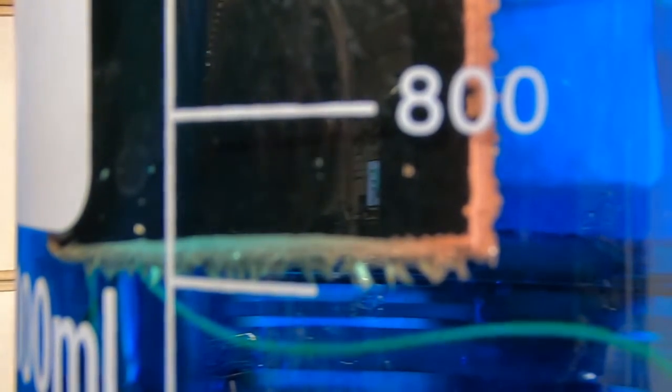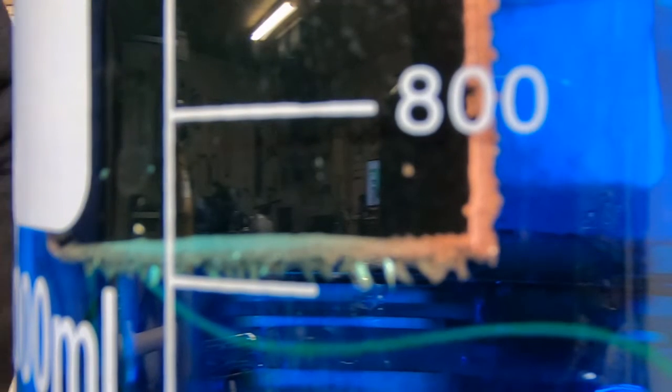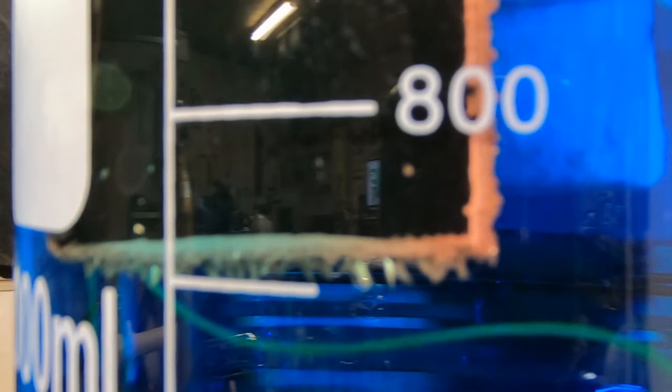Okay guys, what we're observing here is a periodic current reversal phase where I have converted the cathode into the anode, and we can actually see cation flows streaming off of the crystal ends like streamers from lightning rods on a building. So if we think about the reverse analogy of this, when we are plating metal, these little crystals act like little antennas or lightning rods, and they consolidate this cation flow and accumulate it into these points, causing a cascade effect where the crystals and the lumps get worse and worse because of that streamer antenna effect.